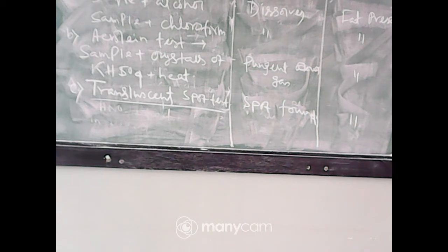Now it is the time to observe. Okay, everyone completed.